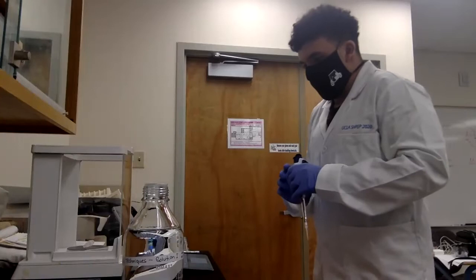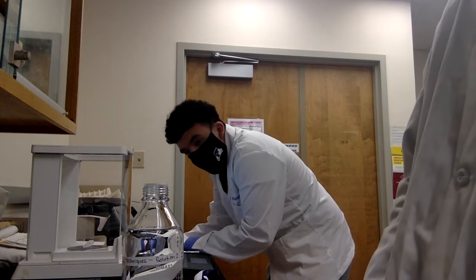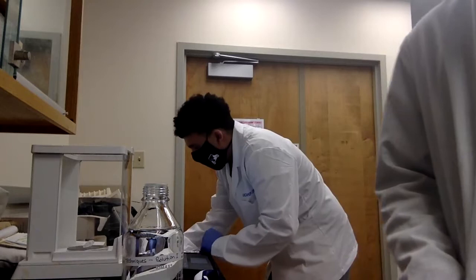Okay, then you write it down. This will be your first data. So the mass for solution 1, 50 microliters is 0.0496 gram. I mean, if you don't record this, it's fine. I will take care of it and send it to you.